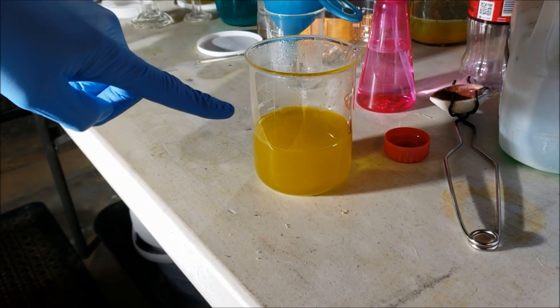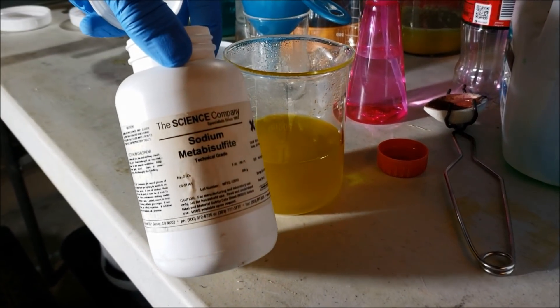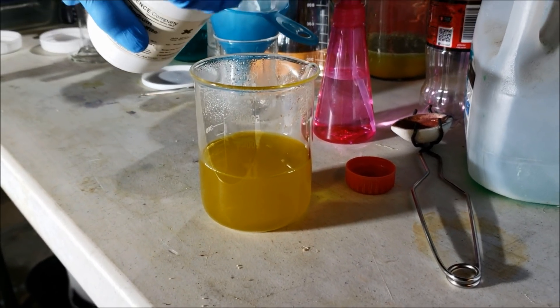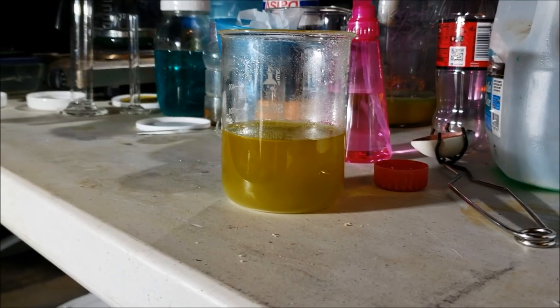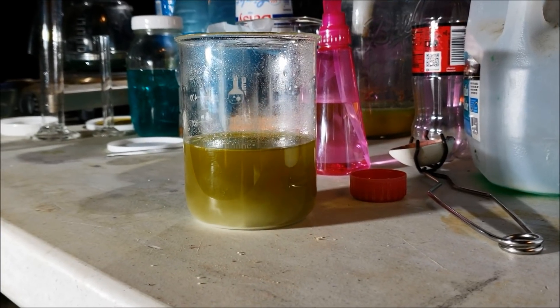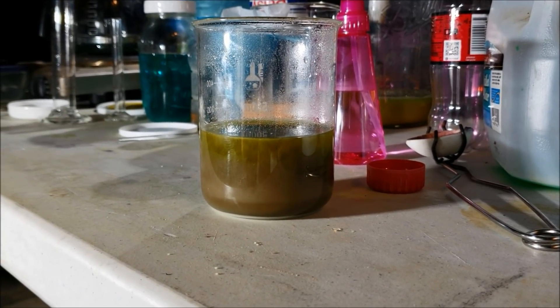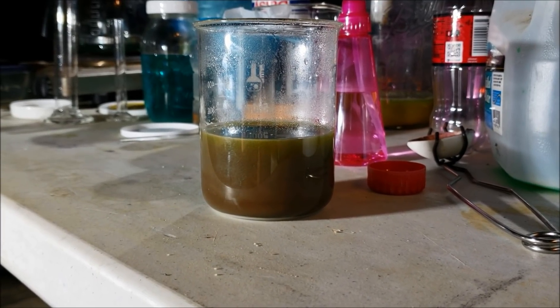Now we want to precipitate the gold out of the liquid. To do that, we're going to use sodium metabisulfite. I'm just going to drop that in there and watch — it'll start getting kind of dirty looking. All the gold is going to be these little brown dirt clods that fall down to the bottom. We'll let all that settle overnight, then strain it through a filter and rinse it.